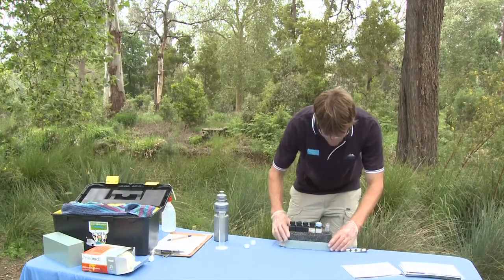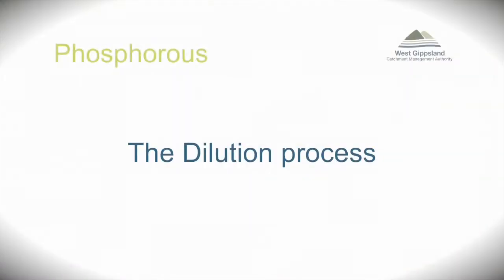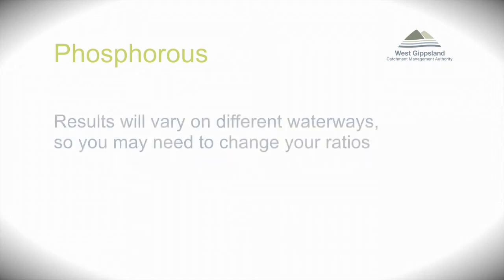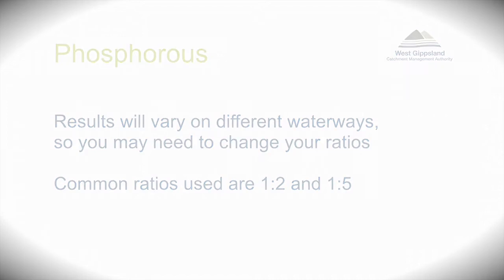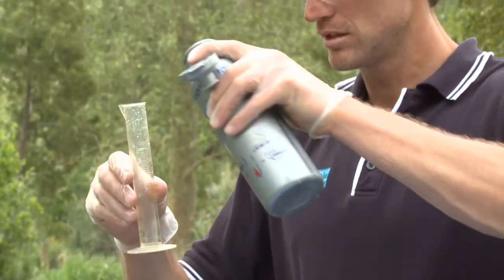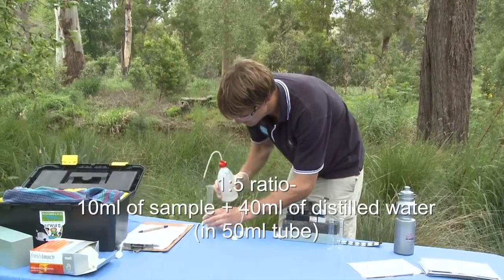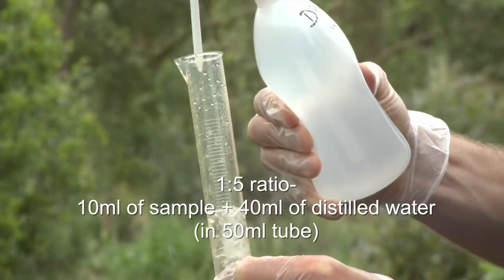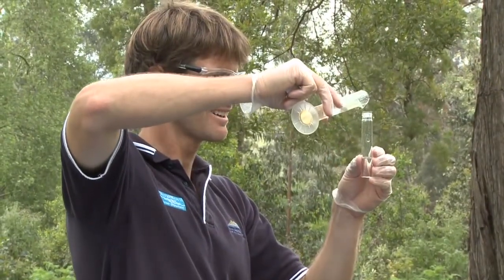If you notice that your sample is too blue or well above 0.14 milligrams per litre, you'll need to dilute your sample. Results will vary between different waterways, so you may need to change your dilution ratios. For example, you may use a 1 to 2 ratio or a 1 to 5 ratio. In this example, we're going to dilute the sample 1 to 5, which means we're going to add 10 ml of the sample to 40 ml of distilled water in a 50 ml measuring cylinder. Your sample is now ready to retest.